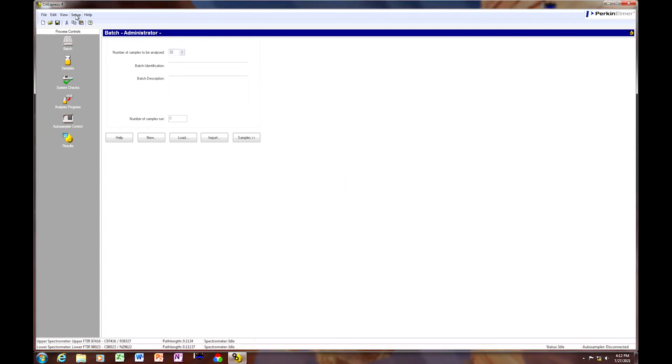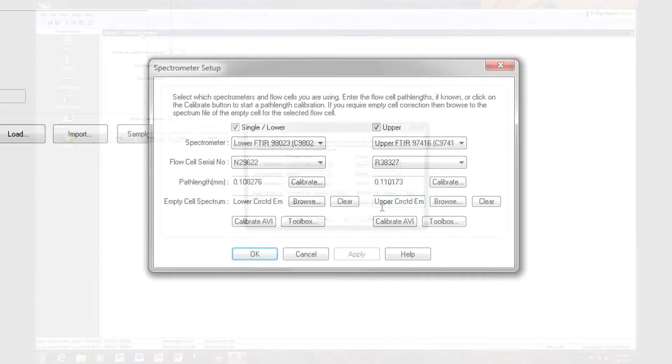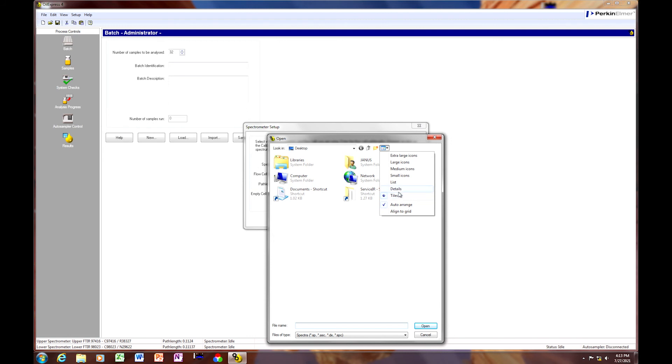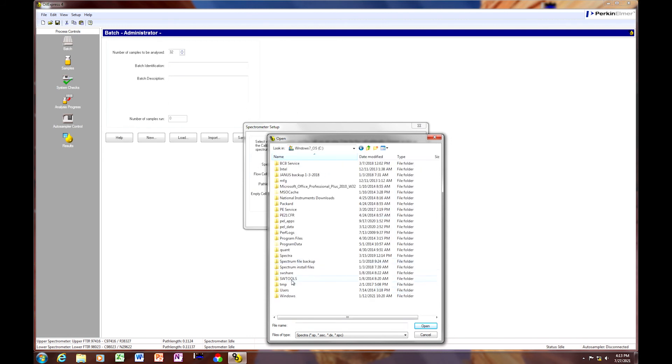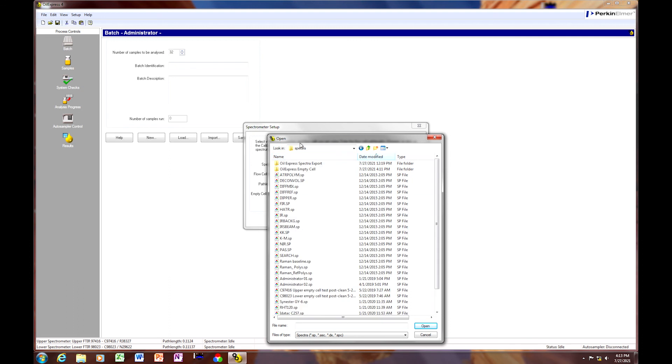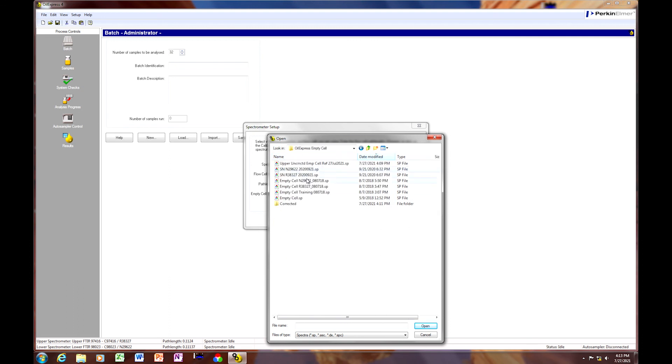You're going to select setup, instrument, spectrometer. And underneath the empty cell reference spectrum, you're going to browse. And you're going to point to pale data, spectra, oil express empty cell, and the corrected folder. And we're going to use the upper corrected empty cell reference with today's date.